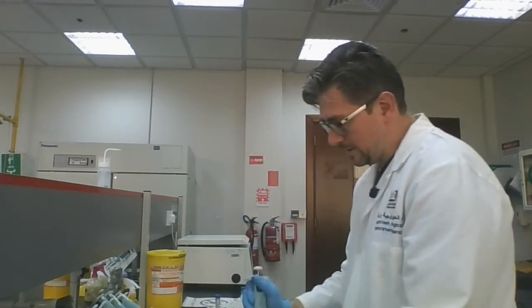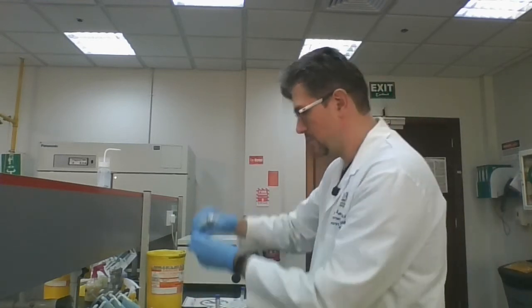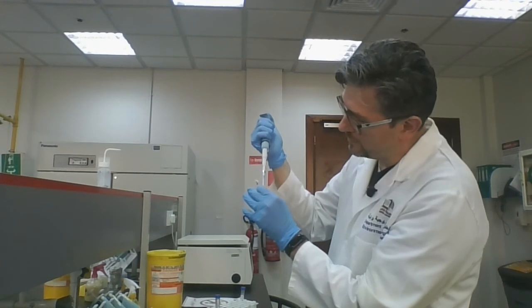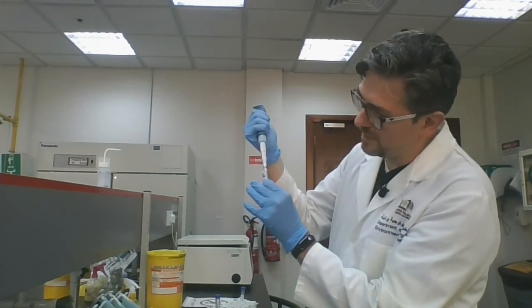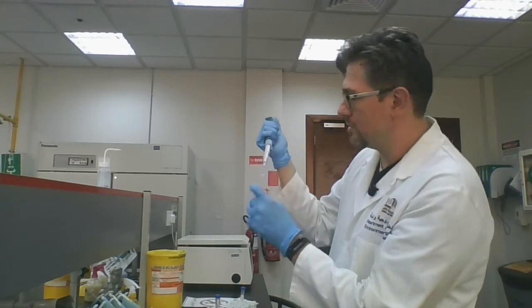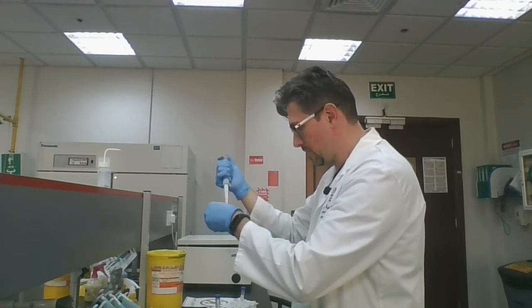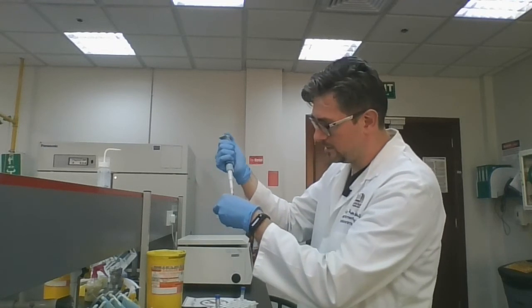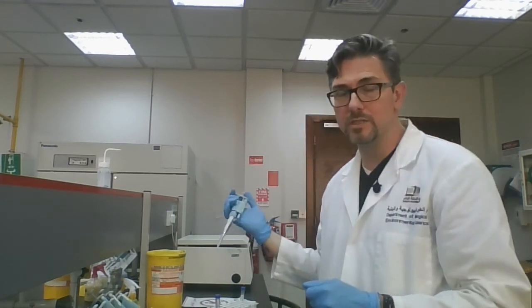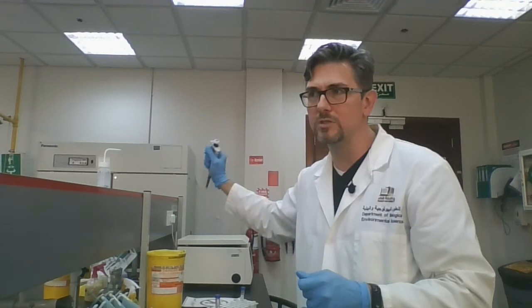And I'm going to collect the next one. And again, just really quickly remove, oops, wrong one. Remove the liquid without taking up any of the solids. Again, all the white stuff that you saw there, that's all that genomic DNA, the proteins, and the membranes of the bacterial cells. And so what we have in the liquid is the RNA and DNA, potentially still some protein left over, but mostly just the molecules we're interested in. So mostly just DNA and RNA.